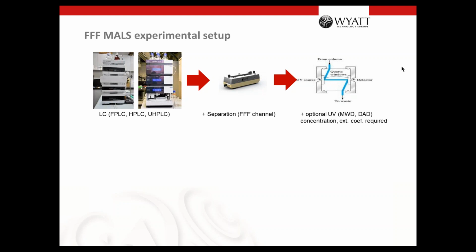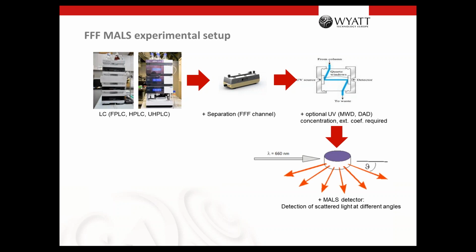And it also gives you, when you have the extinction coefficient, precise information about how much sample elutes at which time. But up till now, you did not measure the size. And for measuring the size, we normally add a MALS detector. There is a way of predicting the size from FFF theory, but for an absolute measurement, you need the MALS.